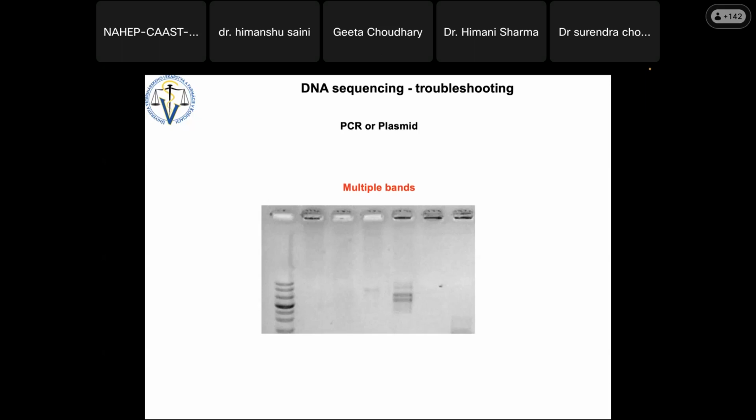take a 200 microliter tip, cut it a bit, and then you have a 10 microliter long tip, or whatever you have, a needle, for example. The idea now is you see the gel. Put the gel on the glass or wherever on the transilluminator, and you are seeing that band, and punch the tip into that band, the exact band.